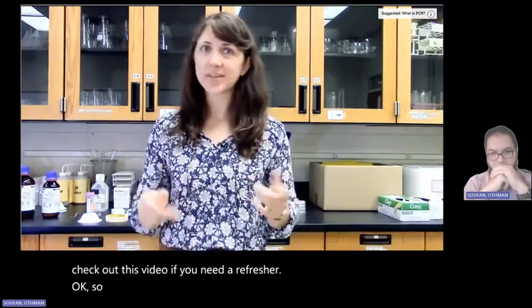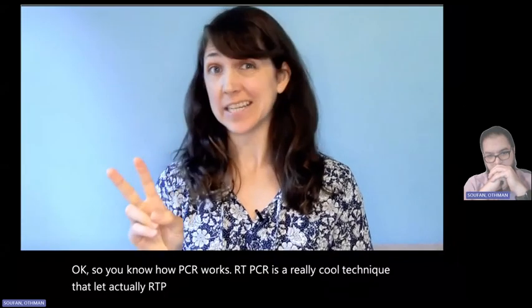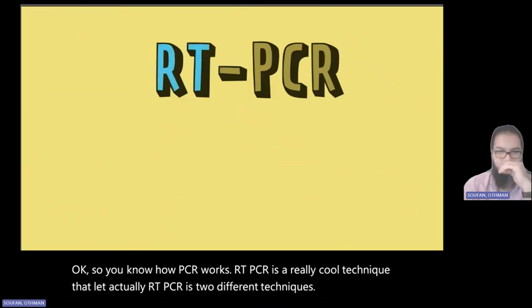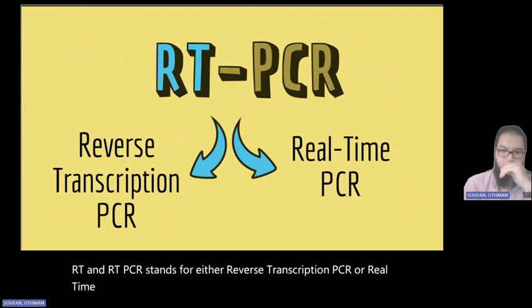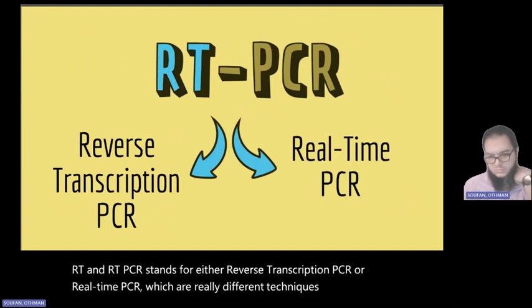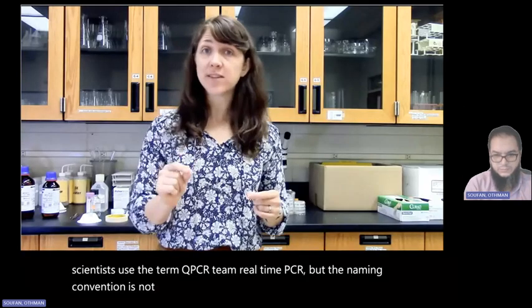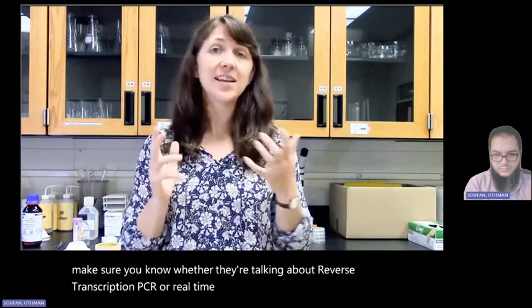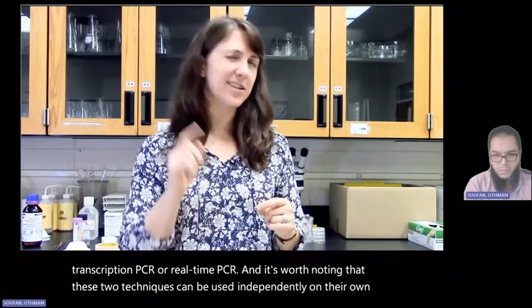Okay, so you know how PCR works. RT-PCR is a really cool technique that actually, RT-PCR is 2 different techniques. The RT in RT-PCR stands for either reverse transcription PCR or real-time PCR, which are really different techniques. Sometimes scientists use the term qPCR to mean real-time PCR, but the naming convention is not standardized. So if you see the term RT-PCR, make sure you know whether they're talking about reverse transcription PCR or real-time PCR. And it's worth noting that these 2 techniques can be used independently on their own, or they can be combined. I'll tell you about that in a second.